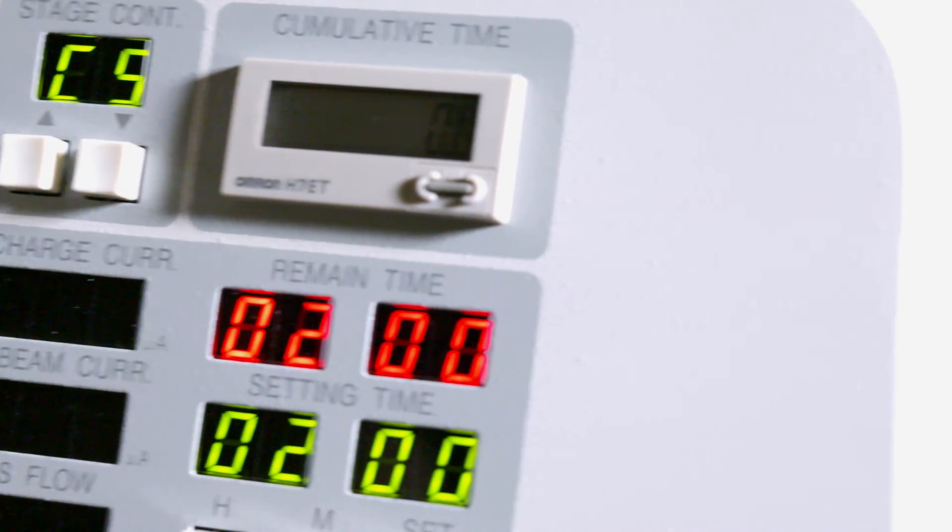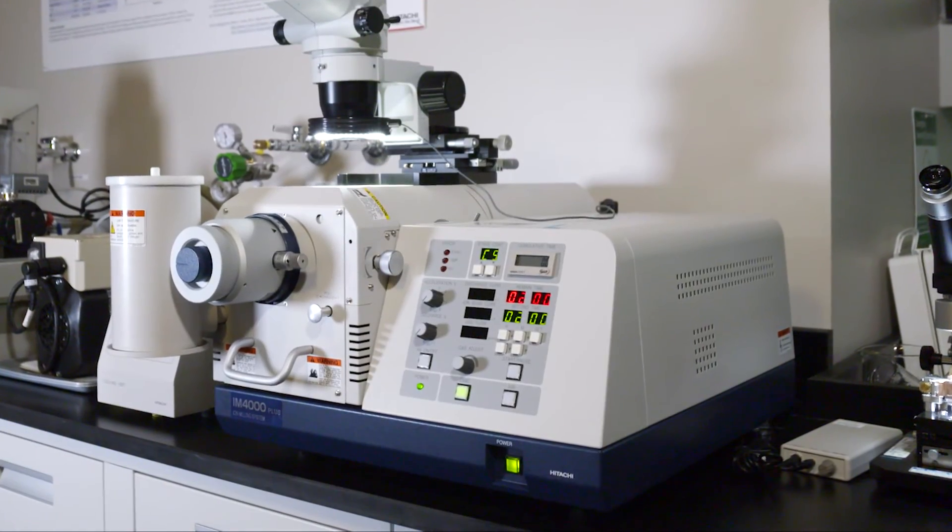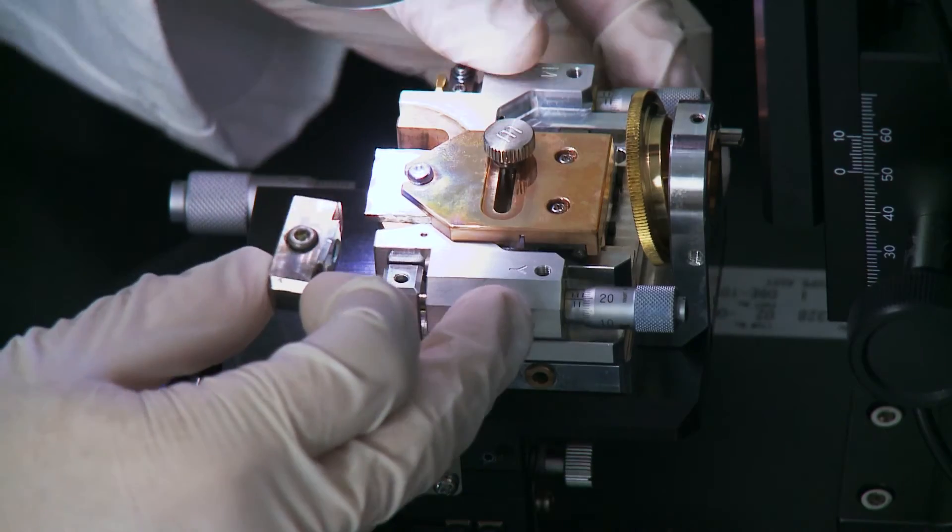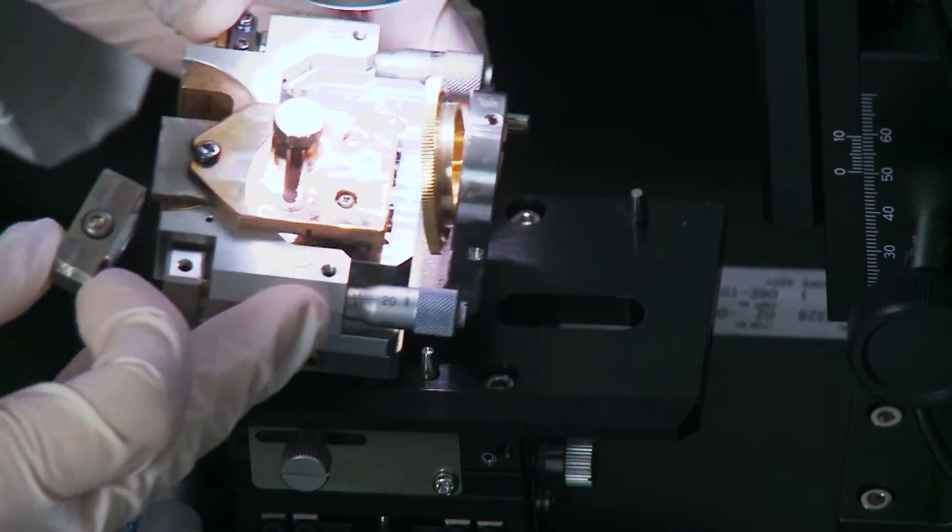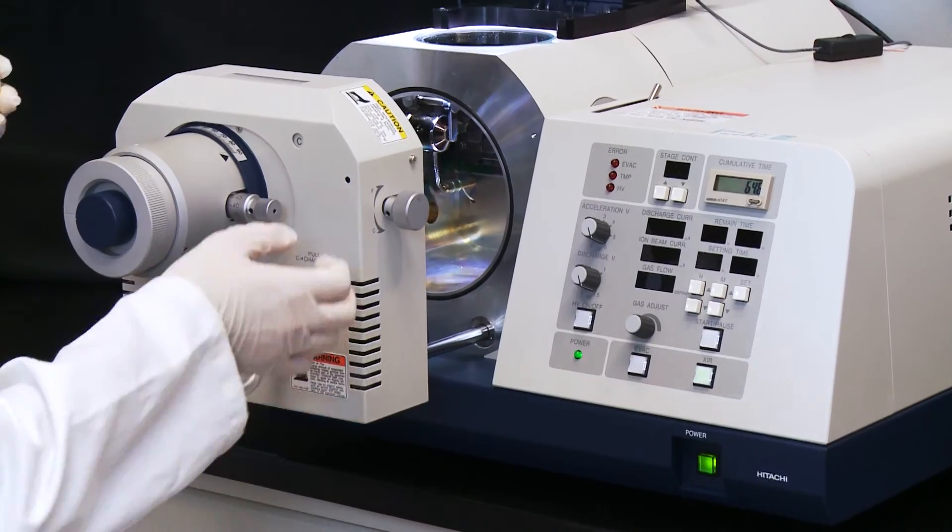The combined ability to cross-section and flat mill samples with the added convenience of a detachable specimen stage that can be removed as a whole allows for simplified specimen preparation and SEM imaging.